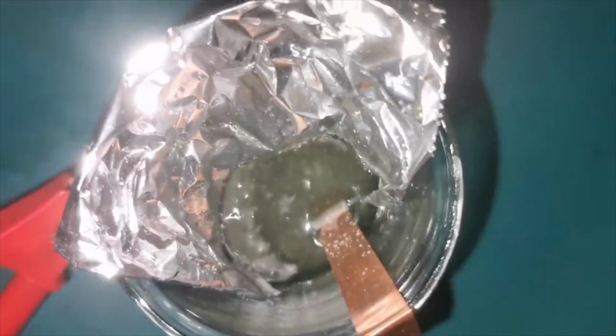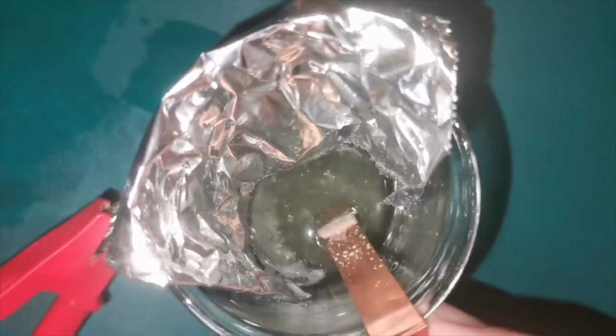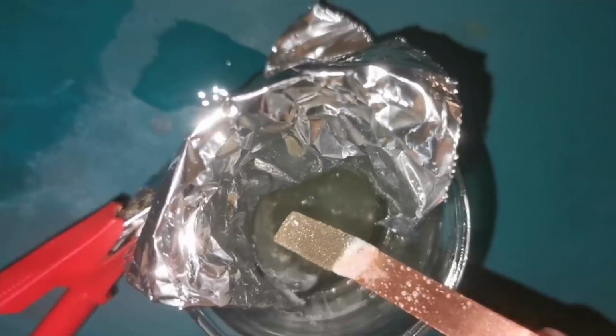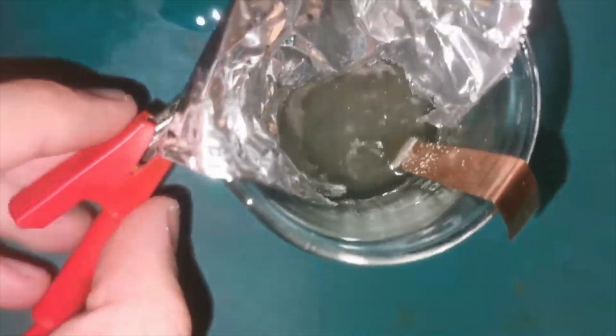I let the cell run on its own for a week and came back to check it on the weekend. Some lithium chloride has crystallized on the cathode, which wasn't expected. The amount of lithium deposited apparently stayed the same, but the aluminum anode was severely corroded, which tells me that the cell is at least still going.